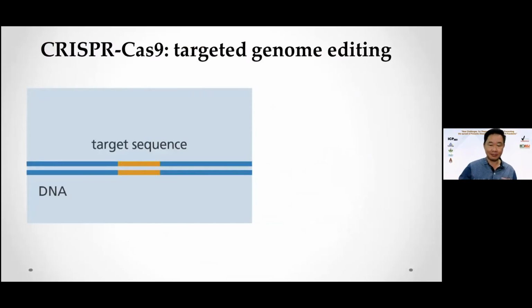So this is the idea. So this is the target. In this case, we are using OV granulin 1. You need to identify the target gene. The first step in deciding on CRISPR-Cas9 is that you need to have the genomic sequence of that gene of interest.